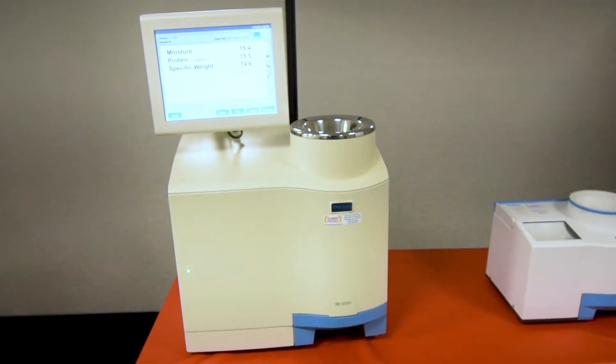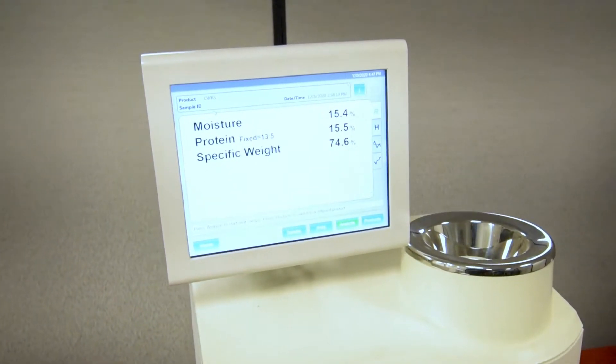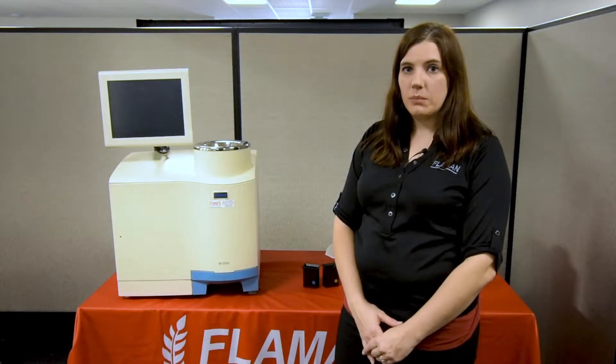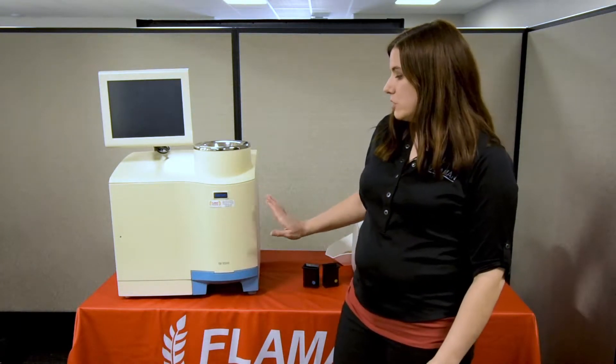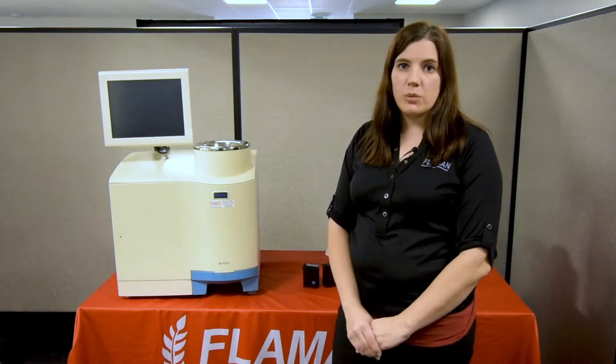We have two models in the Informatic line. The first one is the IM9500. This is more of a commercial unit used in elevators, terminals, seed labs, or processing plants. It has rapid 25-second analysis. There is an optional test weight option. You can hook it up to a printer and have a flour module.